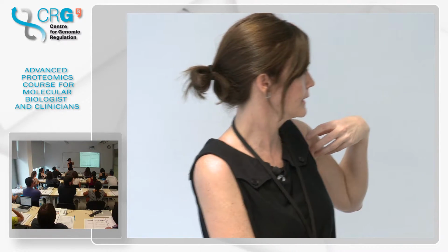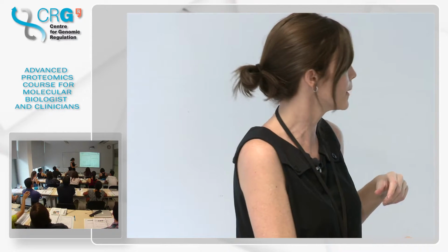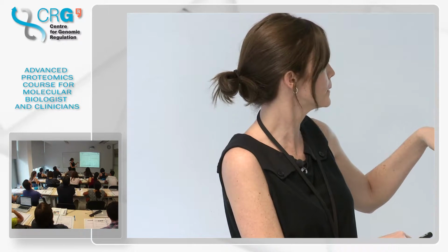This is a tryptic peptide with a lysine, and after the point it tells you which amino acid you would have in the protein but you don't have. The peptide goes from the S to the K, and this would be the previous one, which makes sense because trypsin was used. And this is the position of the peptide inside the protein.